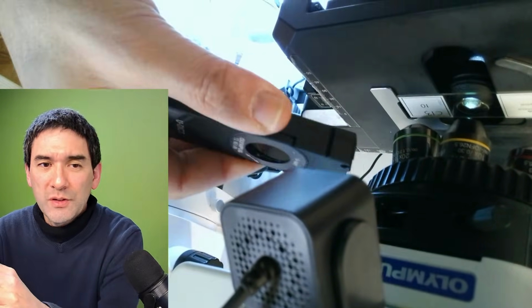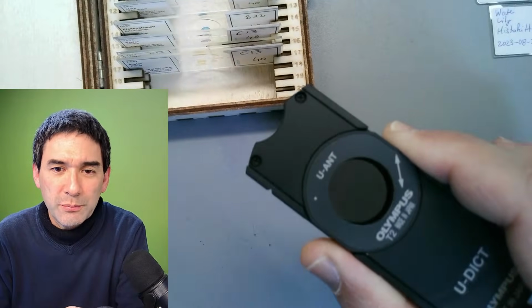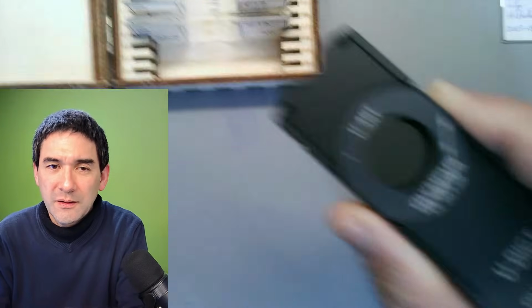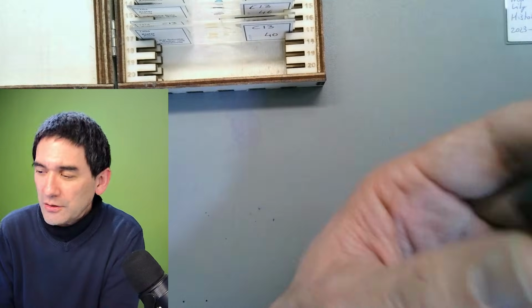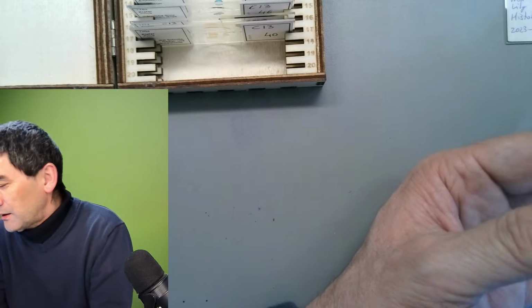If you are interested, I can take it out and show it to you. It's called the Wollaston prism. By turning this here, I'm shifting something, and then this is able to change the colors. In case you were wondering a little bit how this actually works.